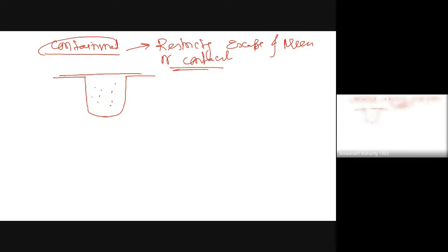Containment means whatever microorganism you are dealing with, because you are the researcher in the lab, and for example there is air supply there, air is coming out also. If this is a pathogenic one, this will be very difficult for you, too dangerous. So there are always some regulations and biosafety protocols, which I will definitely share with you as study material. But before that, try to understand how the microorganisms are basically classified. All the systems, all the containment processes, how are they classified?